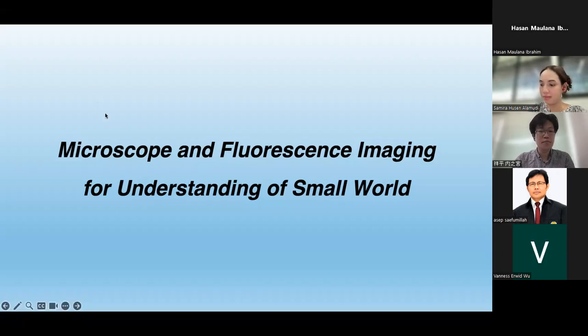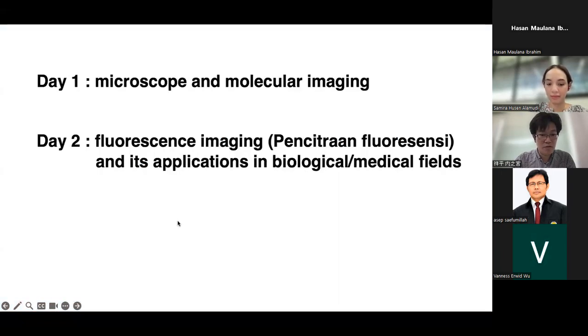Okay. So this class consists of 2 days. In the first day, today, I will talk about the microscope and molecular imaging. In the second day, I will talk about the fluorescence imaging.